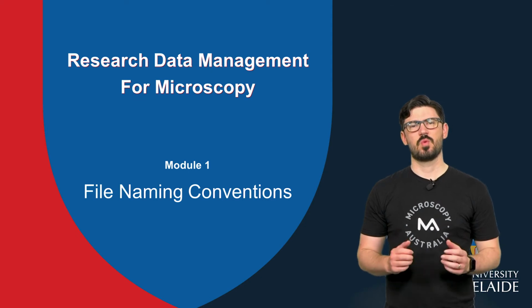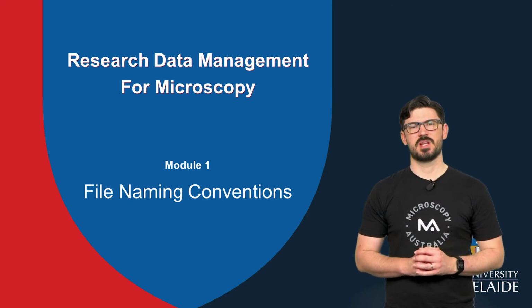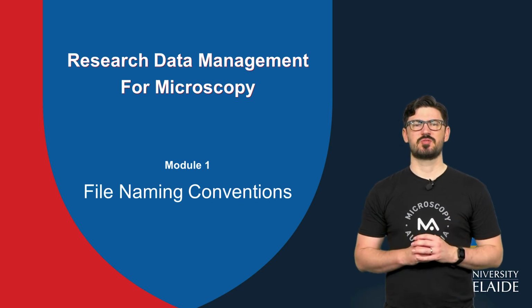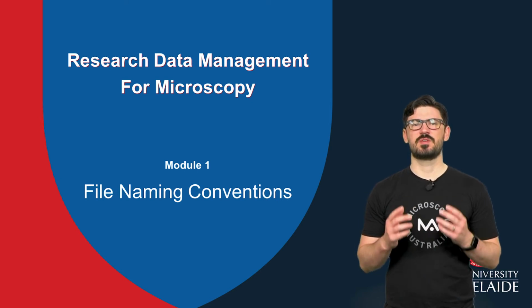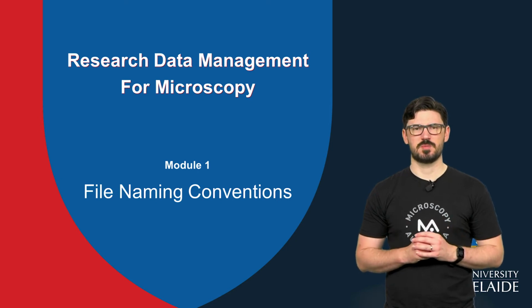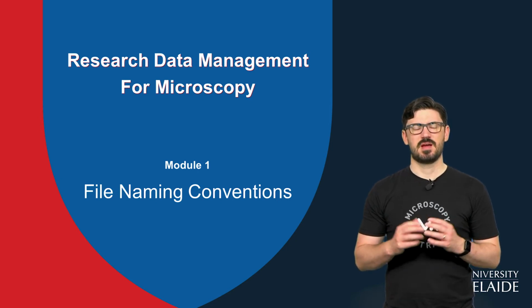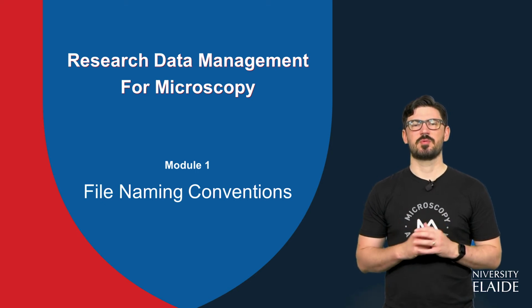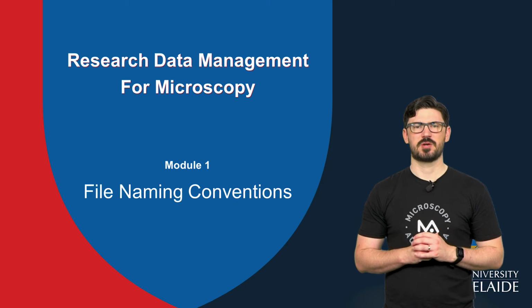So hi, and welcome to Module 1 of the Research Data Management for Microscopy training resource. In this lesson, we will introduce file naming conventions that you will find useful for naming your own microscopy data. And at the end of this module, you'll have had time to create your own convention in preparation for your first session on the microscope. So let's get into it.